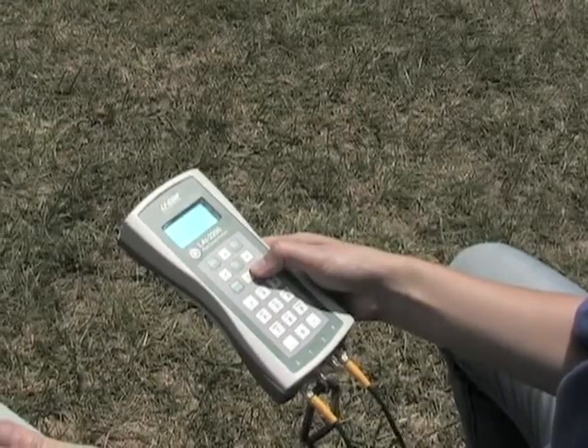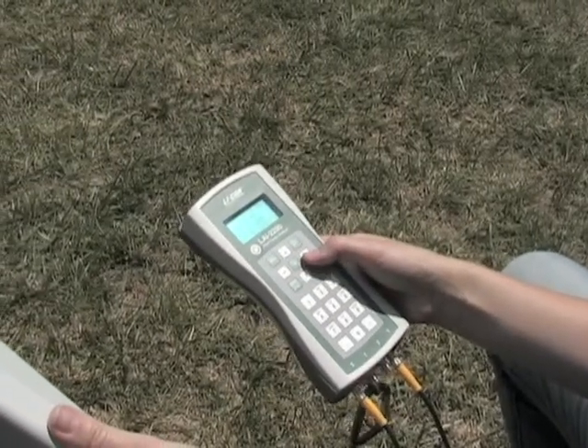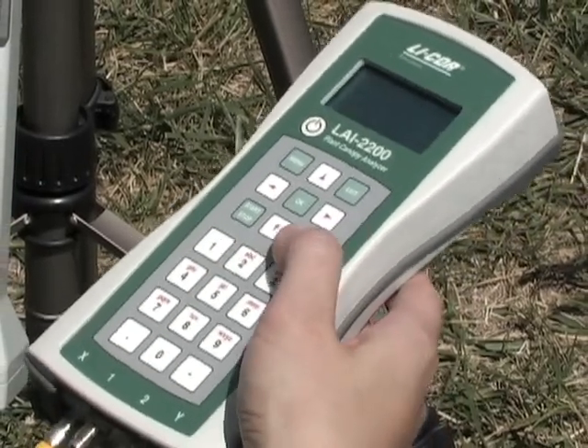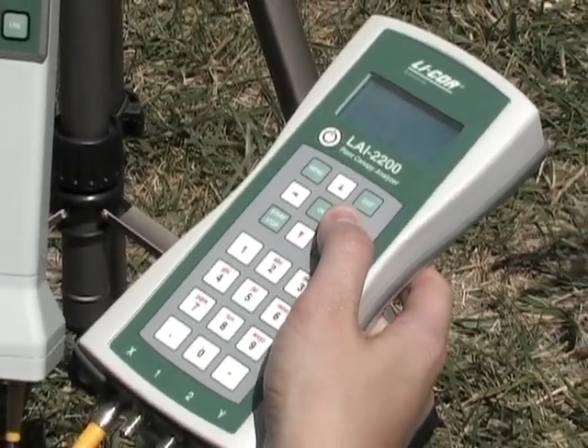The LAI 2200 has a completely new, ergonomically designed, lightweight control unit with a large four-line display and 128 megabyte memory capacity for data storage.